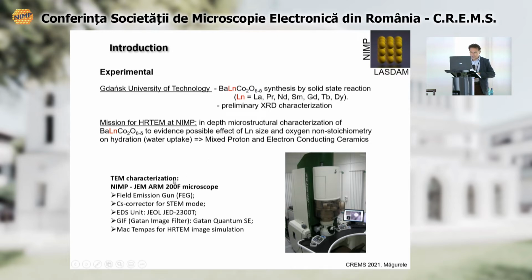So the studies have been performed on the Cs corrected microscope, the ARM 200F, which is provided with an EEL spectrometer, a Gatan Quantum EEL spectrometer, and we also had to use some programs for HRTEM image simulation.